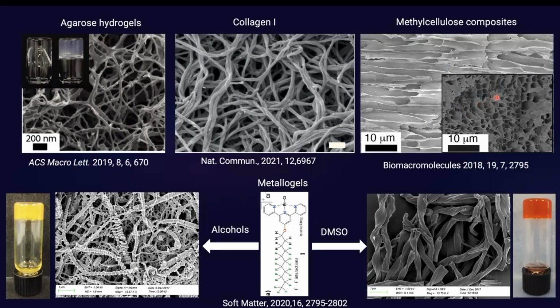If you take a simple organic molecule and it forms different types of gels in different solvents, it also has a different structure. You can clearly visualize this kind of nanoscale structures. On the left side, you can see screw-like, or here more like twisted helical structures.